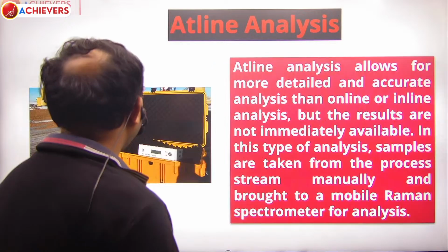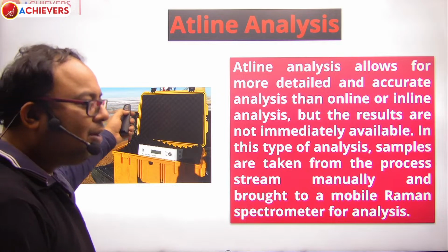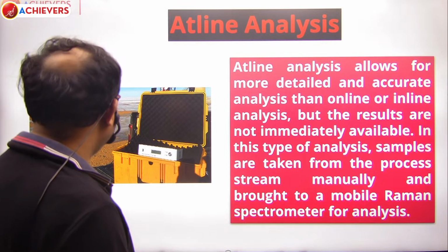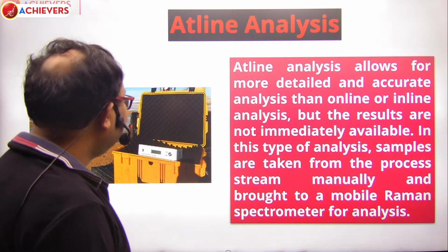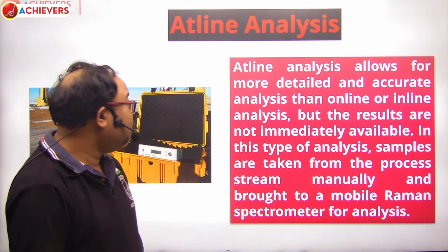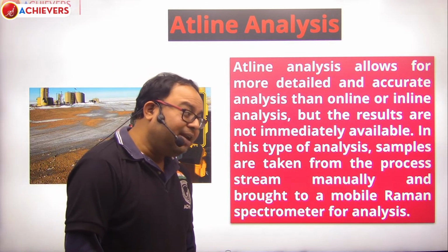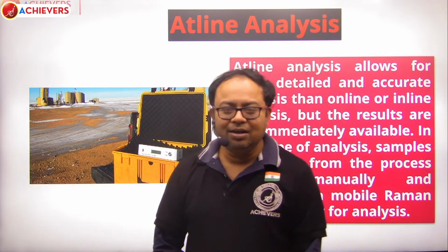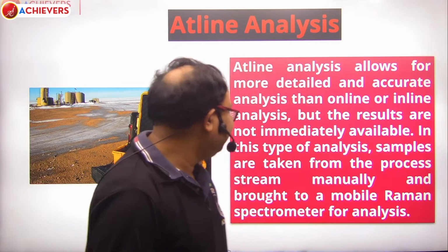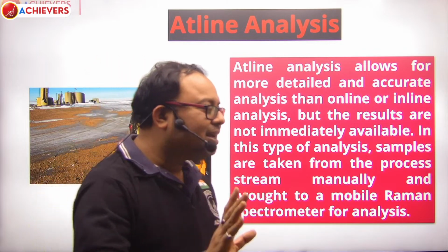Next, we are moving on to at-line analysis. This is the wonderful picture of an at-line analyzer. Okay. So let's have a look. At-line analysis, what is that? At-line analysis allows for more detailed and accurate analysis than online or inline analysis. When you are talking about precision and accuracy, you have to opt for at-line analysis. But the results are not immediately available. That's the con.